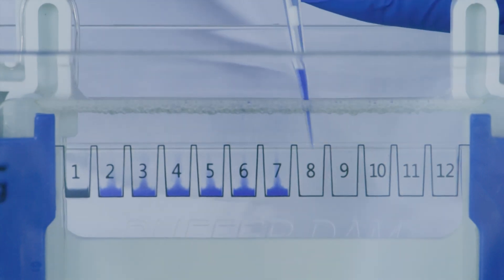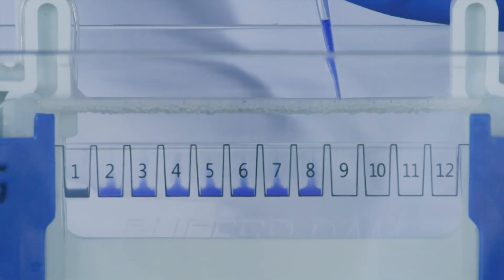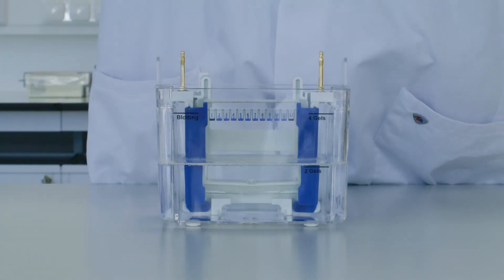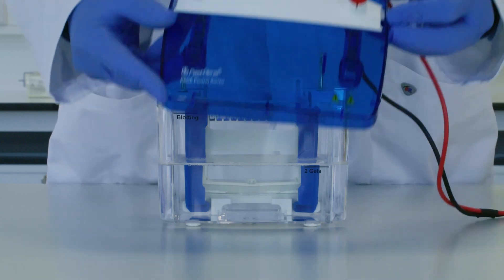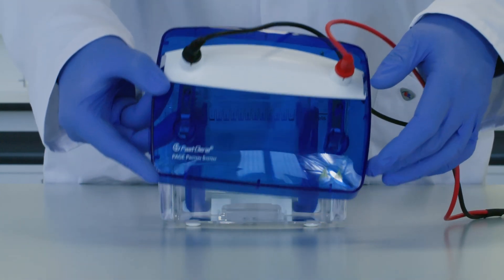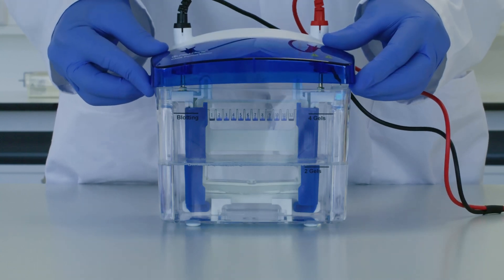Additionally, apply a protein marker to the GIL in order to be able to estimate the size of the protein bands. Select the lid with the power connectors. Match the red and black electrodes of the lid to the red and black marks on the tank, and connect the lid to the electrodes of the inner chamber.